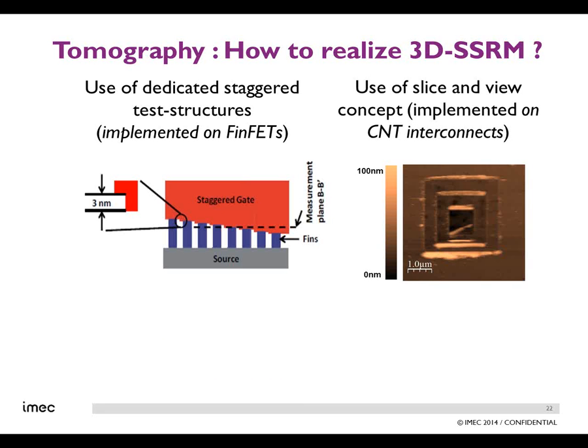In theory, diamond should last forever, which means you can use it not only to measure, but also to dig into the material, to remove some material. It's what you can see here. We make scans here. With decreasing scan size, you can generate something like a pyramid inside your material. Each scan, you remove a few nanometers of material, and then you can measure at different depths.